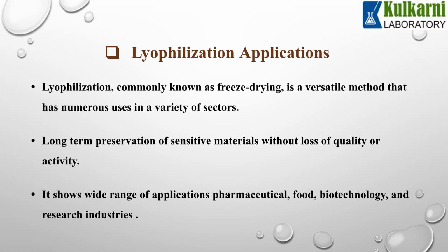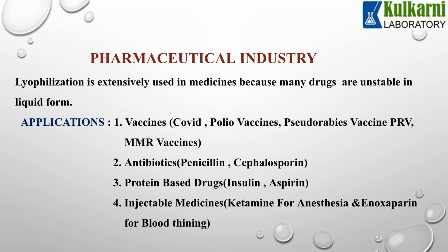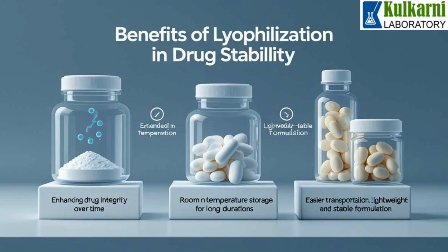Lyophilization, or freeze-drying, is a versatile preservation method across various sectors. It ensures the long-term preservation of sensitive materials without compromising quality or activity. Applications span pharmaceutical, food, biotechnology, and research industries. In the pharmaceutical industry, lyophilization is vital because many drugs are unstable in liquid form. Applications include preserving various vaccines, antibiotics like penicillin and cephalosporin, protein-based drugs such as insulin and aspirin, and injectable medicines like ketamine for anesthesia and enoxaparin for blood thinning.